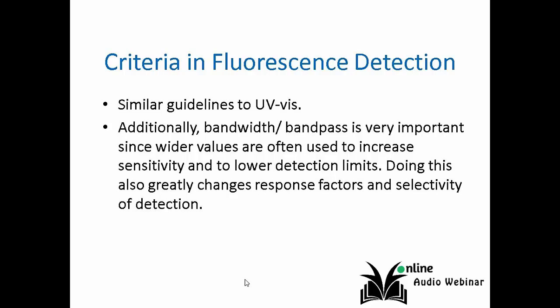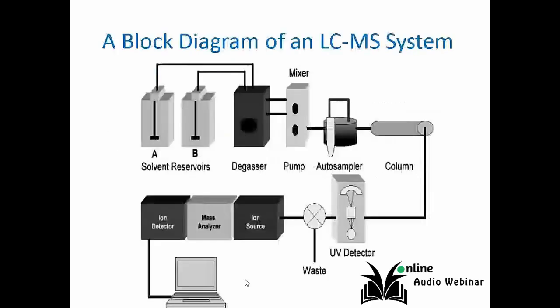issues as far as bandpass, except for one huge caveat. Many manufacturers of fluorescence detectors do not go with narrow bandpass. In order to increase the claimed sensitivity of their fluorescence detectors, they use wide bandpasses, wide ranges going through the emission monochromator.